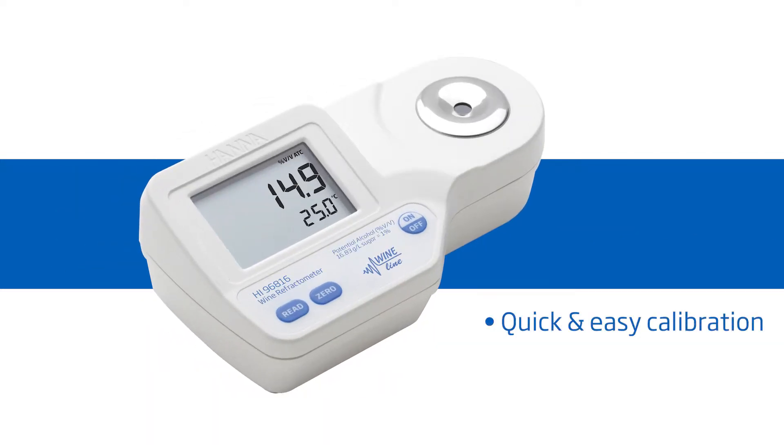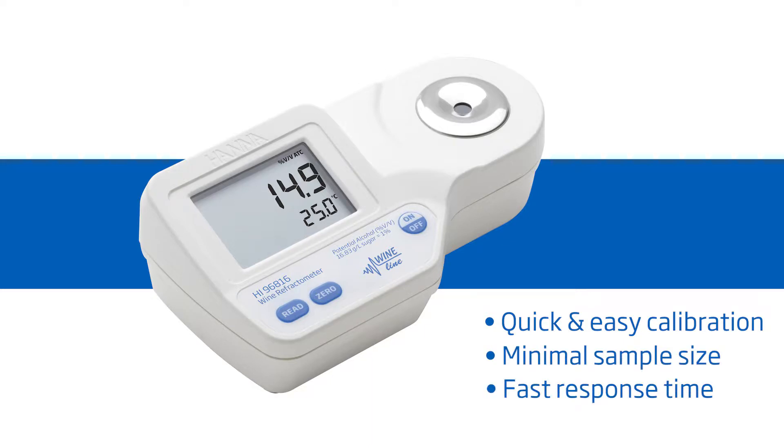It features one-button calibration, a two-drop sample size, and a 1.5-second response time. HANA Instruments provides you with the necessary tools to succeed.